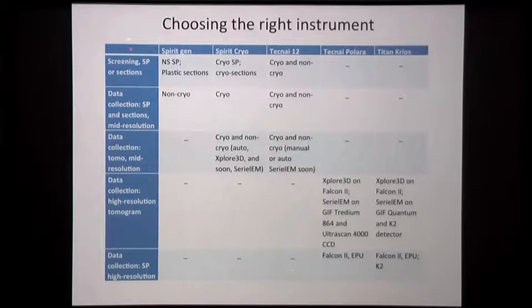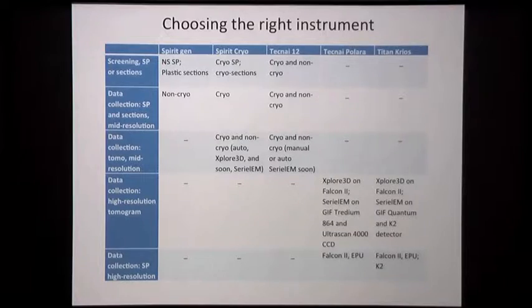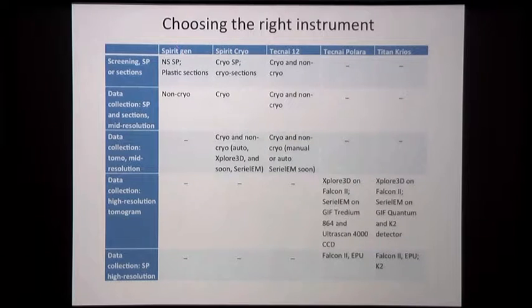I put down here that when you do screening for negative stain and room temperature, of course you go to the Spirit. This is a very easy machine, and well, I don't know, the CCD is broken down. I hope it comes back soon. But on this machine people just jump in and out. Although we say booking, you don't book for too long; people maybe just go for half an hour and book in and out. So it's a very good machine to use.